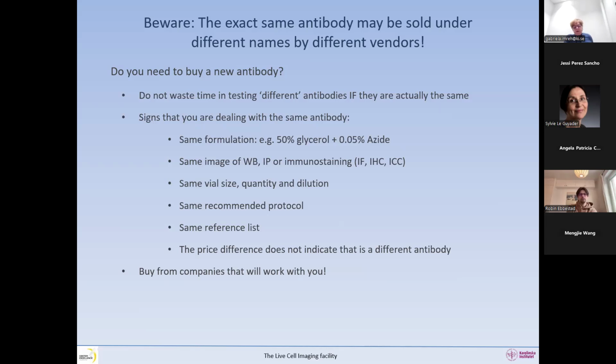Always buy and work with companies that will work for you and will help you to troubleshoot your antibody, especially if it doesn't perform as expected.